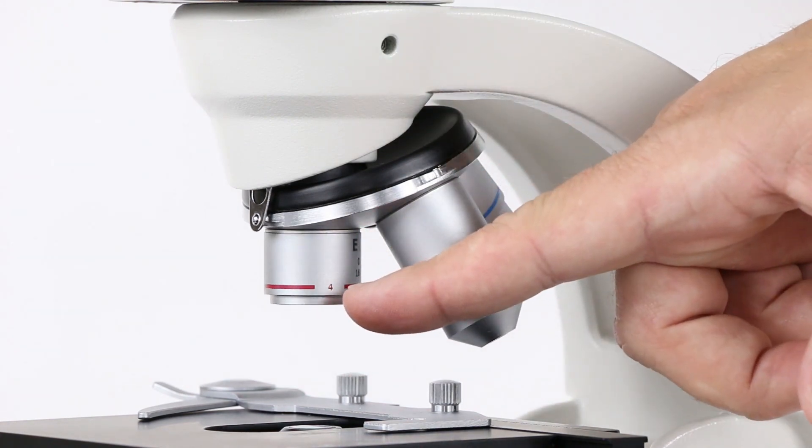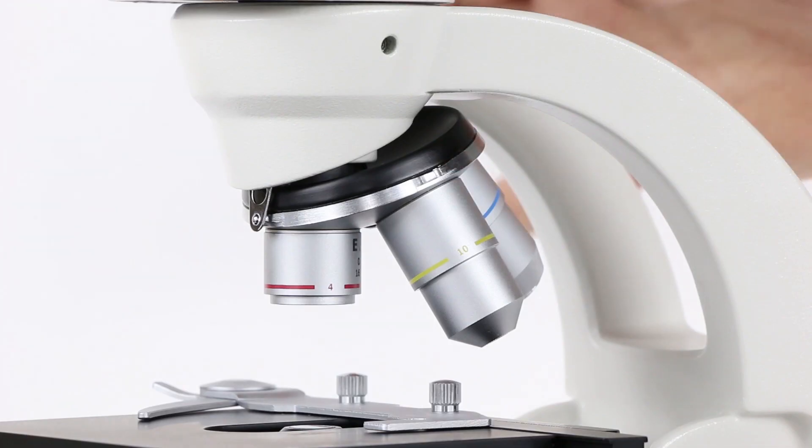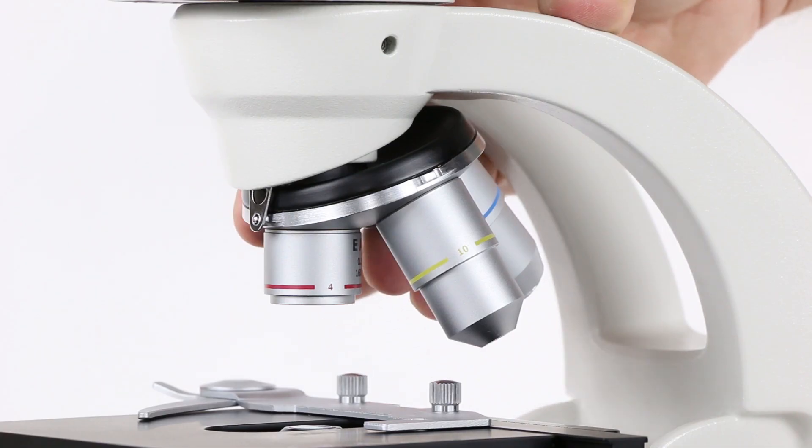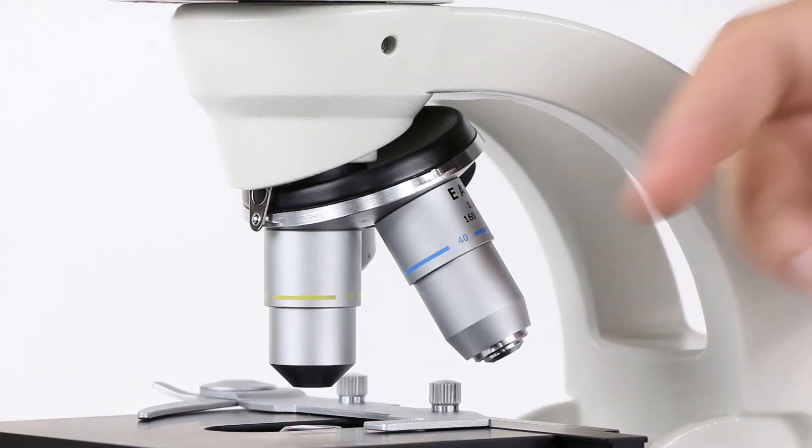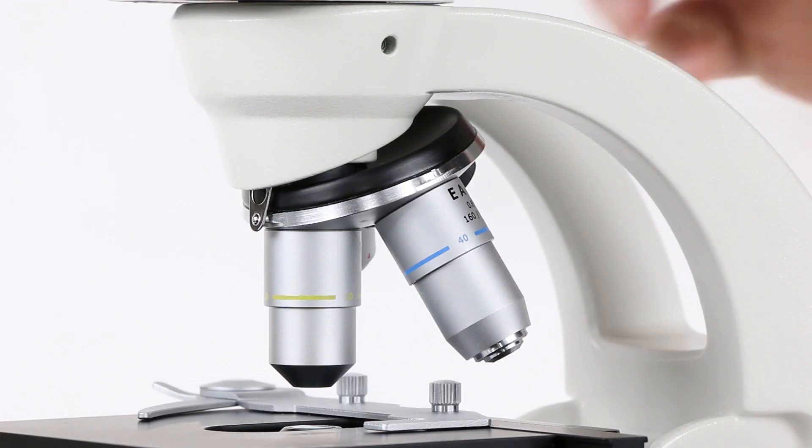The first lens here is called the scanning lens, and it has a magnification of 4x. Turn it to the next one, that's the low power lens, and it has a magnification of 10x.